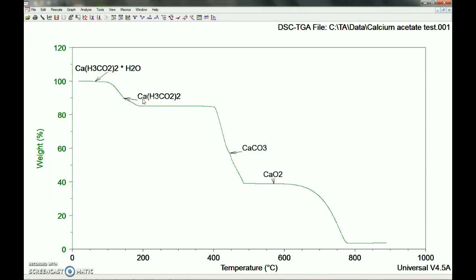And that's about where you just get your calcium acetate. So looking a little bit further on, right here, that's about where the mass loss stops. And you get calcium carbonate because that is about 56%. So if you were to, again, calculate the molecular weight of calcium carbonate and then figure out what the percentage is of your total, that's how you would figure out what that is. So we figured that out to be about 56%.